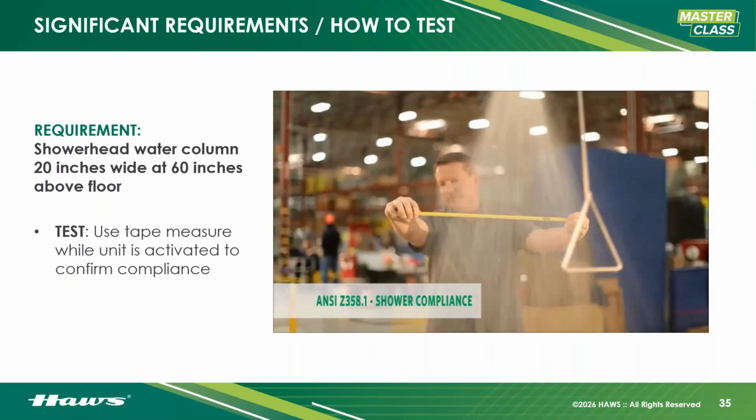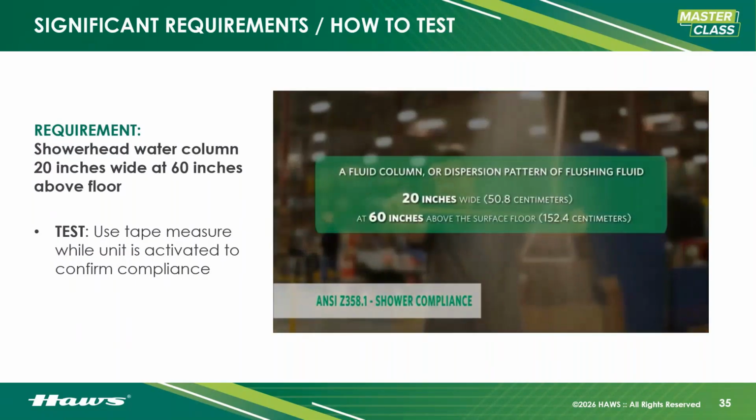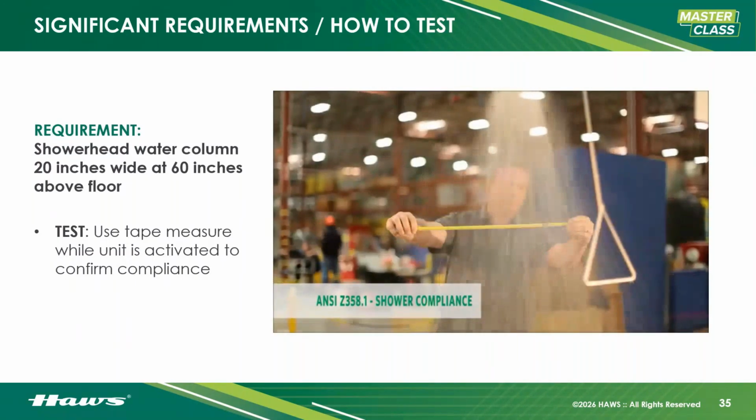Measuring the column. This is all you're going to do. 20 inches wide. Measure up 60 inches. Measure 20 inches across. Make sure it's meeting it, and you're good to go.